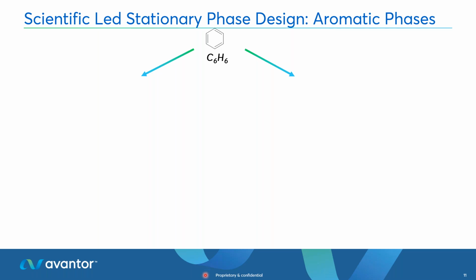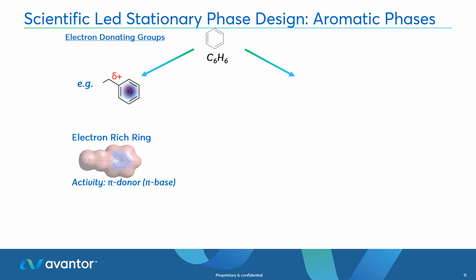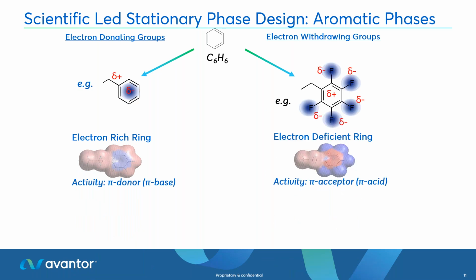I can have an electron rich ring that can interact with aromatic moieties on our analytes. So we'll proceed with that and develop more of a phenyl column. We thought the same for the pentafluorophenyl, so PFP. Interestingly, it has the opposite kind of electron status.